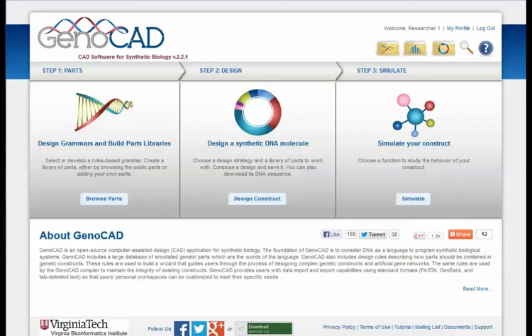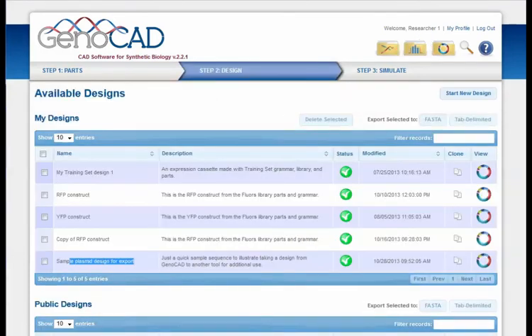I can take these items that I'm developing here, and I can use them in third-party tools. So what I'm going to do is illustrate here how I can take this and use that elsewhere. And if you want the full details about how to accomplish this, of course, see the original tutorial. But let's just take a look at the synthetic design that I've got already in my Available Designs folder. I specifically created one that we'll use for export today just to illustrate some of the features.